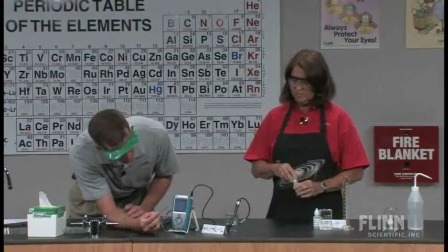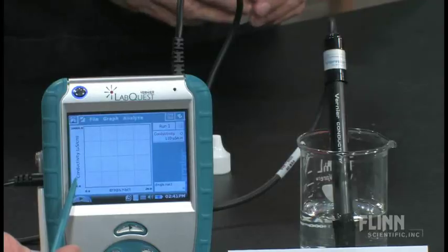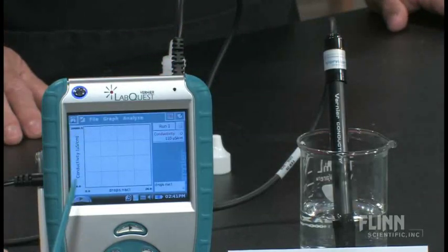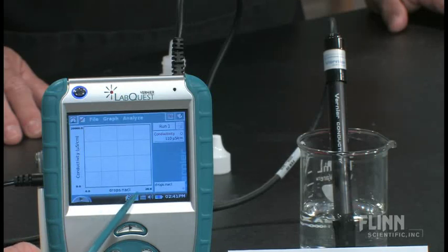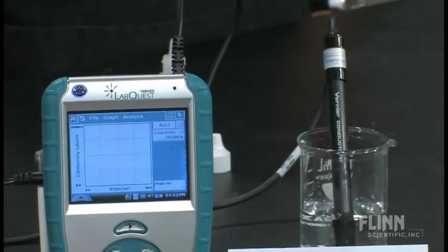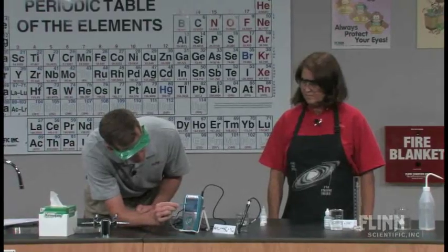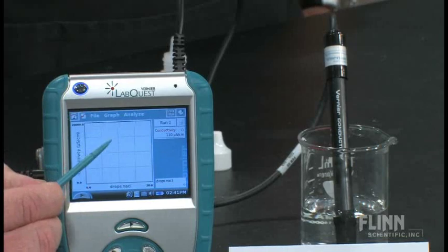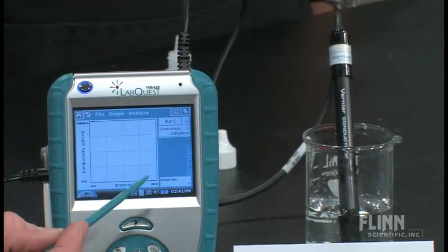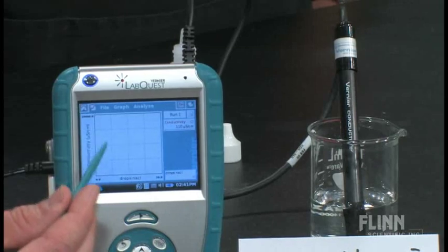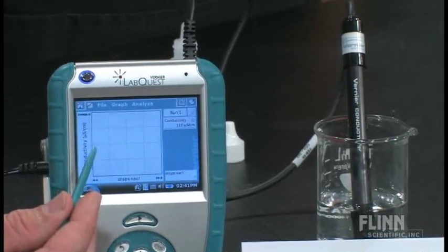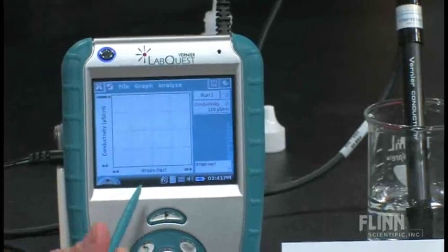When I set my conductivity probes up, it allows me to put in an axis. I've got conductivity along the y-axis, measured in microsiemens per centimeter. Then I've got drops of sodium chloride as my label for the x-axis. We want events with entry, which means that the LabQuest will wait for me to tell it to keep a data point before I type in how many drops I've put in there, kind of like pH probes when we're doing the titration.